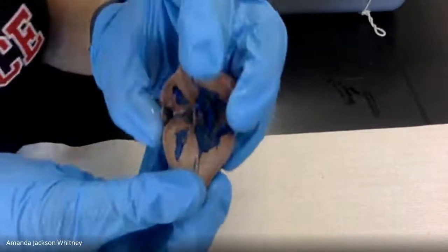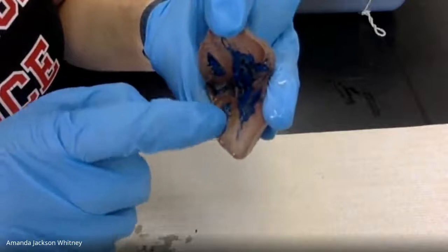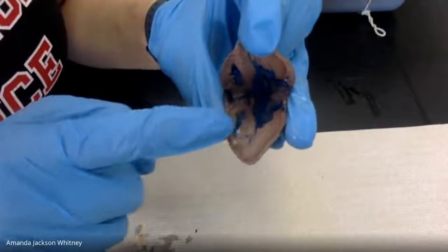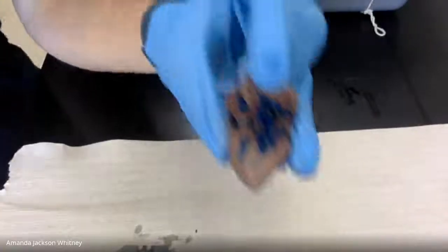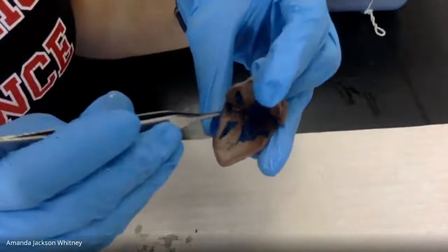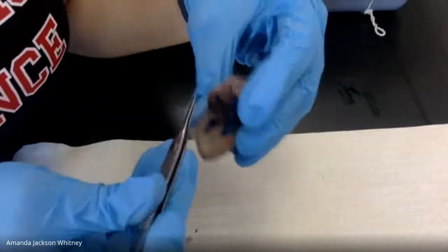So these are both of the ventricles inside the heart. Over here, we have the right ventricle, and then over here, we have the left ventricle. So notice which chamber is larger, the right ventricle or the left ventricle? The left ventricle. Yeah, left ventricle is much, much larger. And why is that? Think about what the right ventricle versus the left ventricle do.